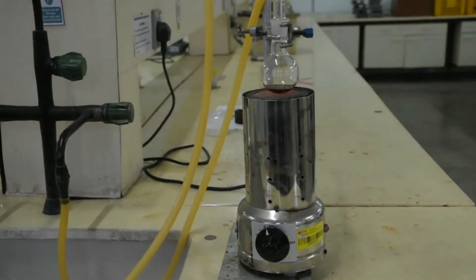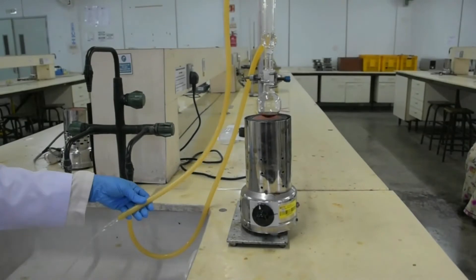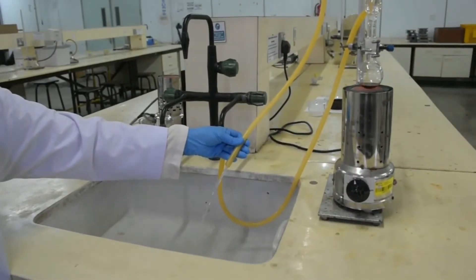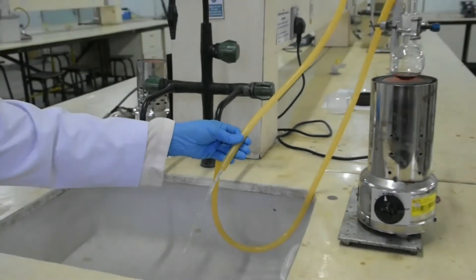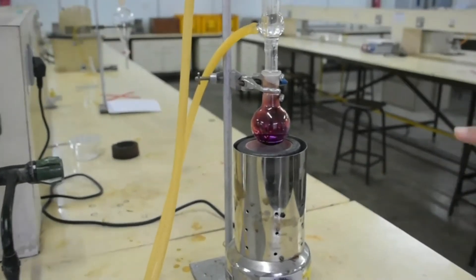Connect the hose and check the water flow. Reflux the mixture for 10 minutes.